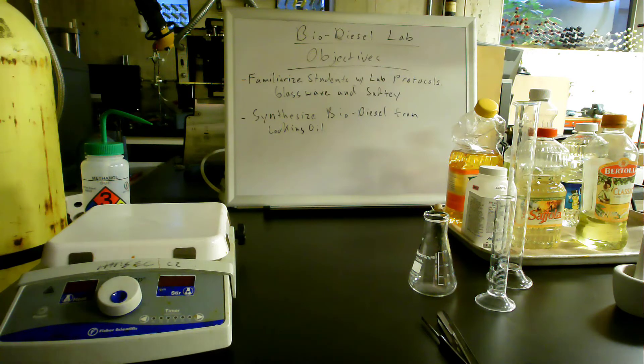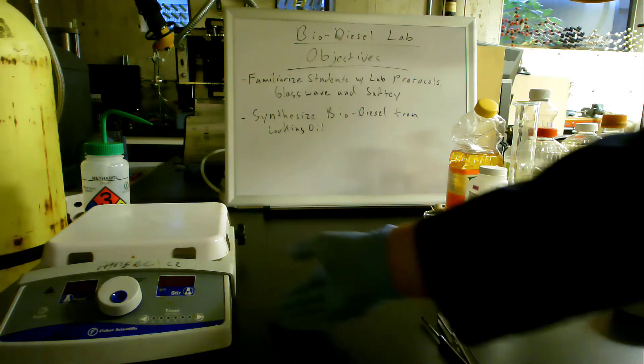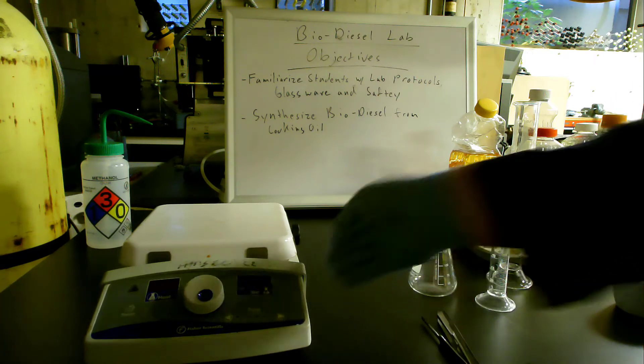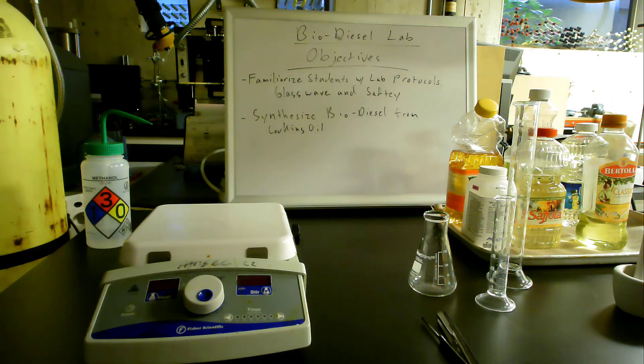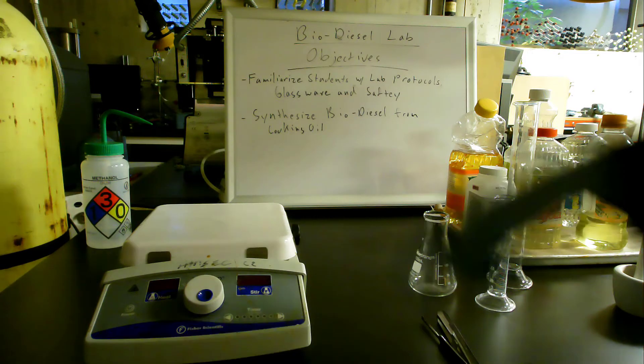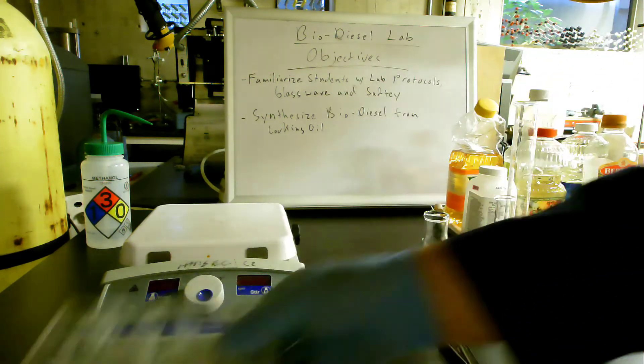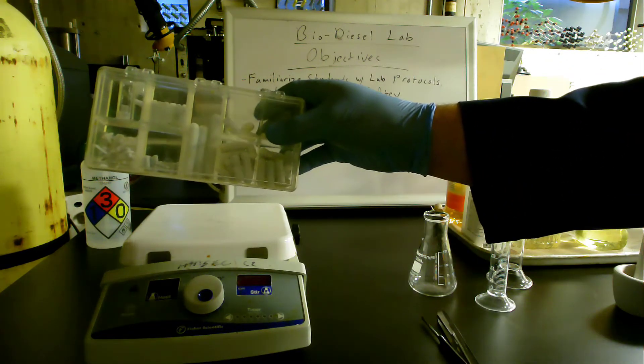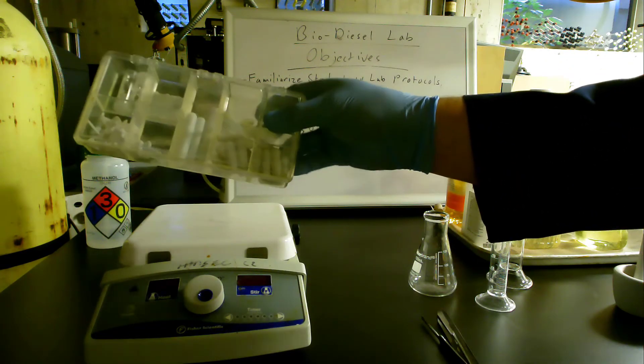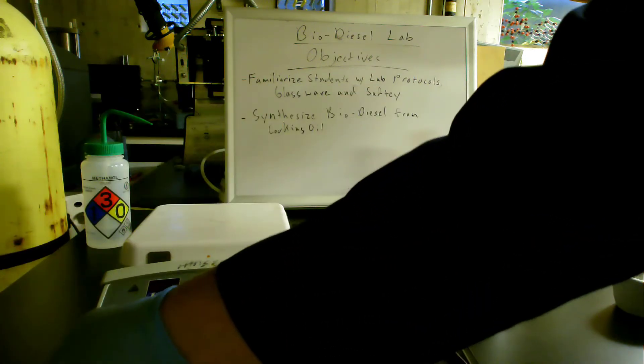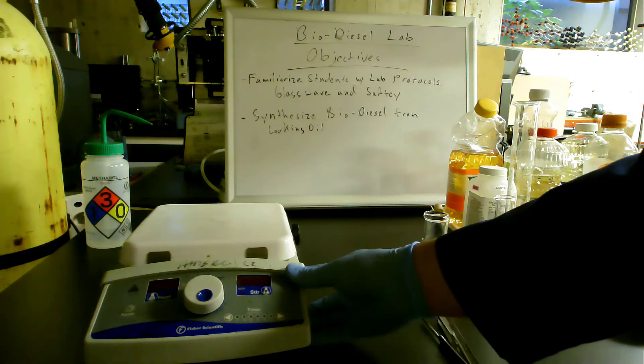Let's take a look at some of our materials. Here we have a stirring hot plate which is named so because it heats stuff up and it can also stir. It stirs using a magnet that's inside underneath the heating element. There's all different sizes of magnets. We call them stir bars and they're teflon coated magnets that you can immerse in your solution and use to stir it.